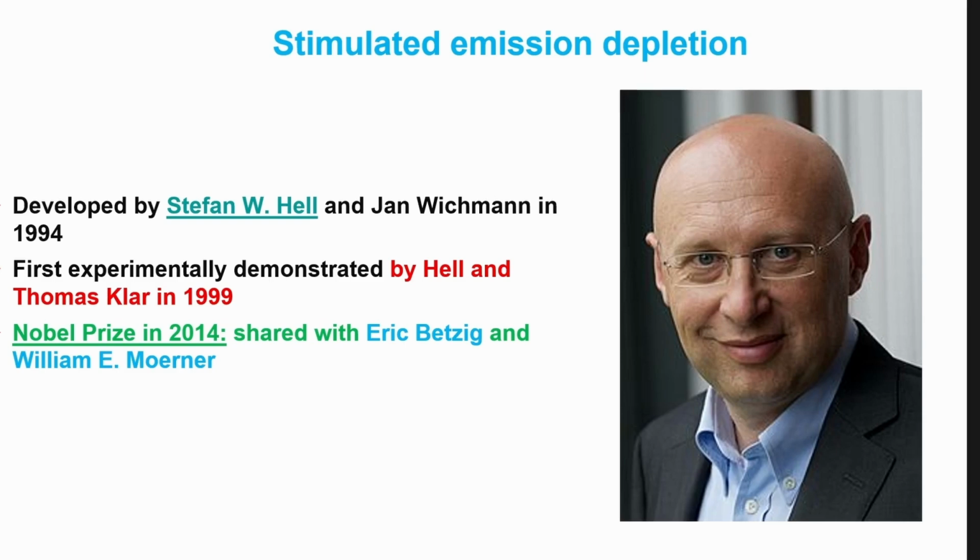The first STED microscope became available, when was that, 2008, I would say, 9, something like that. And then we had one of the very first ones in the core facility in Cambridge, I remember that. So 2009, I would say. And then after it became clear how useful this is, they got a Nobel. So I remember for several years, people were waiting for the news from the Nobel Prize Committee of whether they finally received the prize or not, and then it happened.